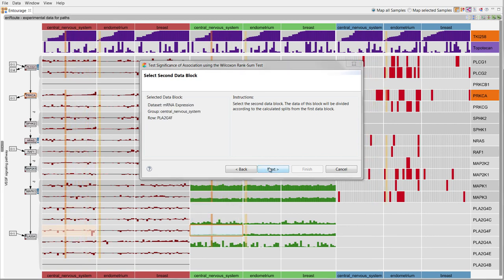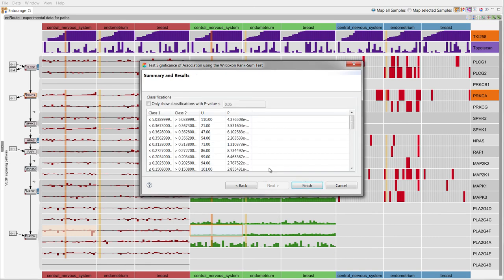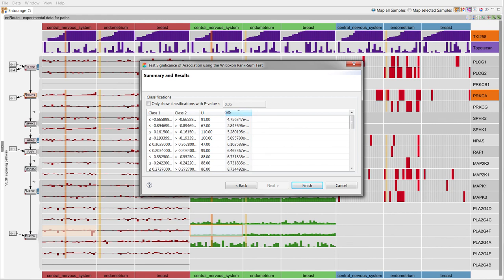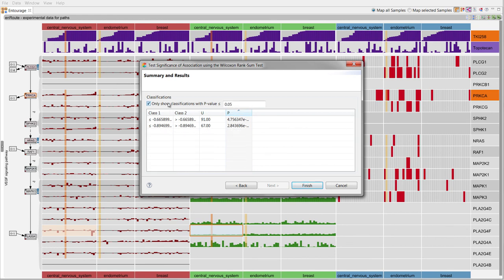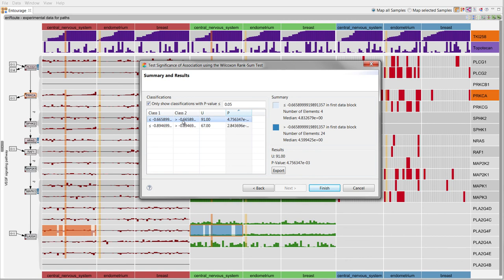The results are summarized in a table that can be sorted and filtered. By selecting an entry, the results are shown in detail and the overlays in the visualization are adapted to the classification.